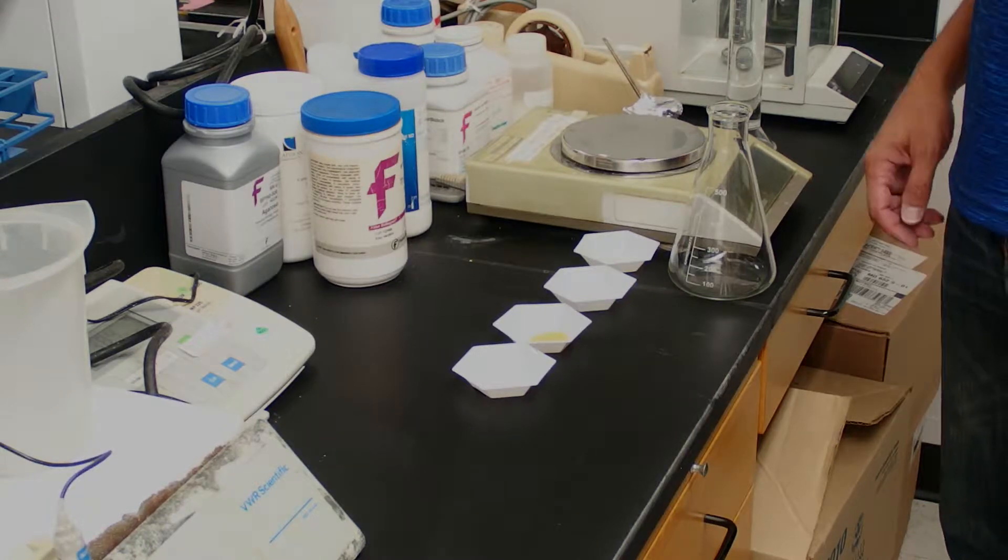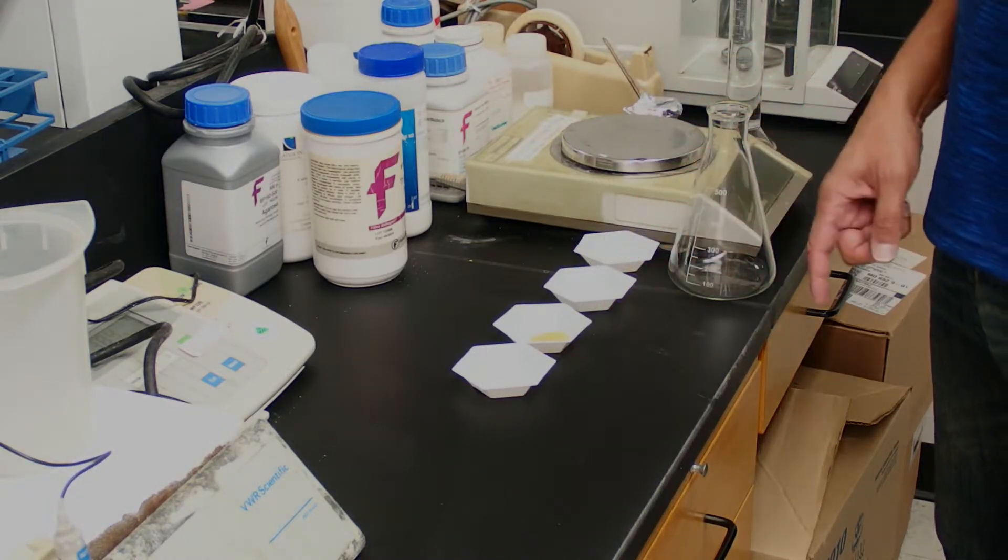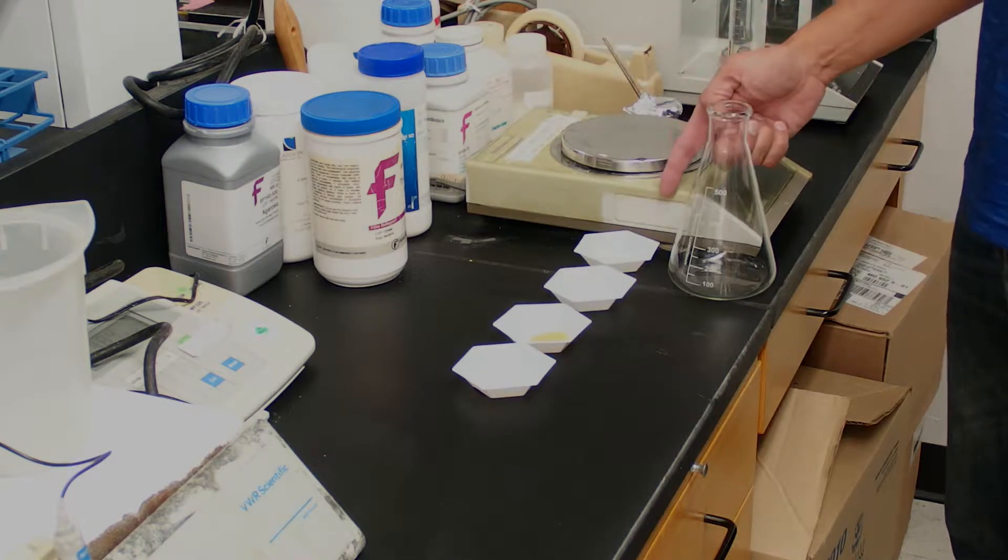I'm going to show you how to make LB agar plates to grow E. coli on. You'll have to weigh out the desired amount of tryptone, yeast extract, sodium chloride, and agar.